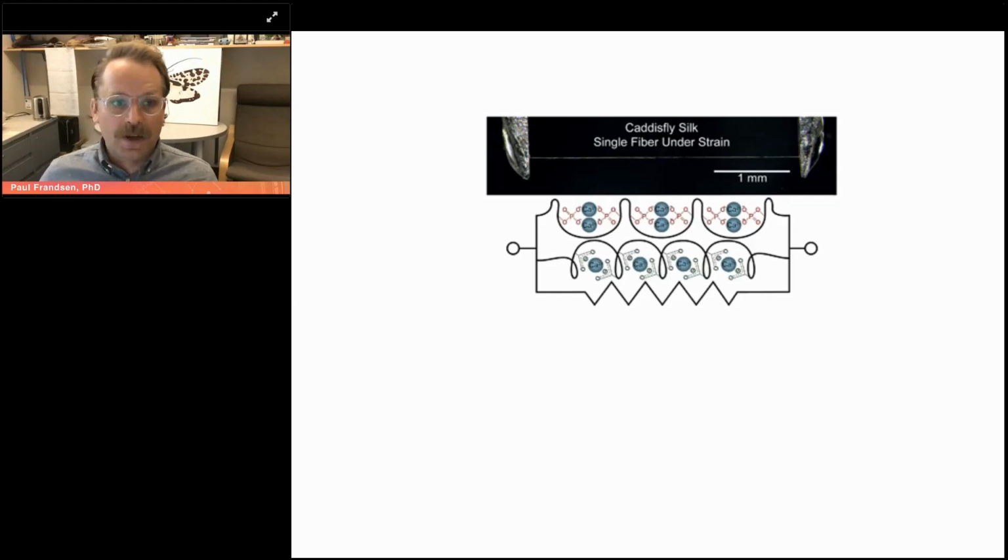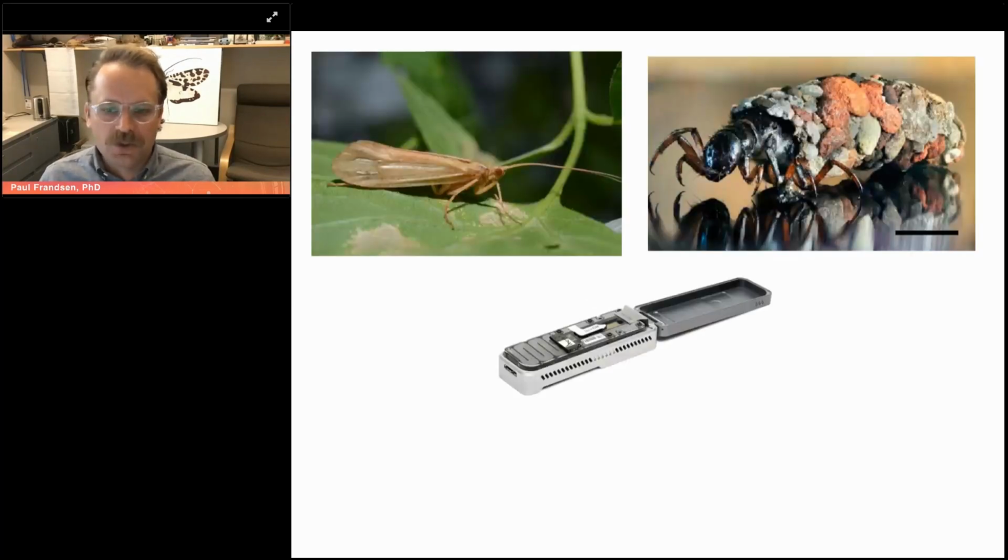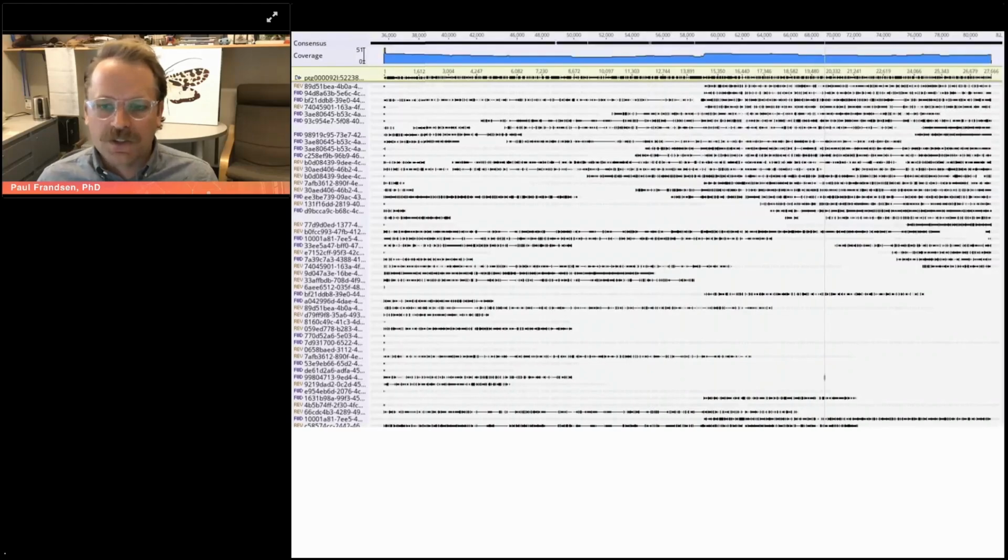We got really excited about using these long read sequences to try to generate caddisfly genomes. And so we kept trying to do it. The first two were with an older version of PacBio technology and then an older version of Oxford nanopore technology. So we decided to try to sequence as many of these as we could to try and understand the diversity of these genes across caddisflies. And we were first using Oxford nanopore technology, one of their older technologies, the 9.4.1 pores. And we started to notice something interesting.